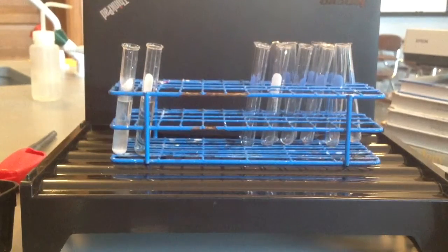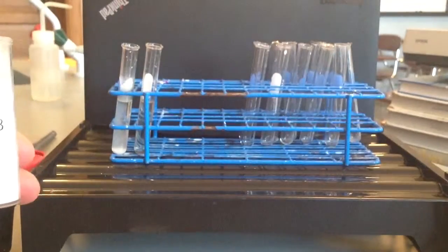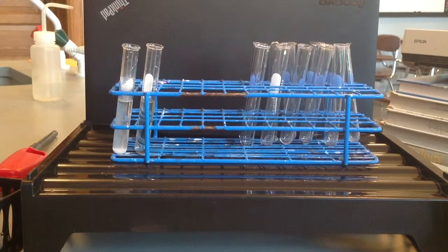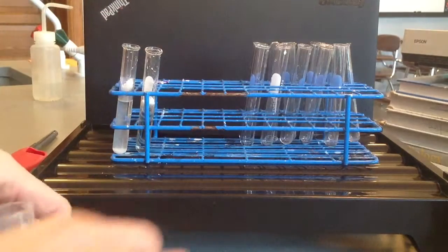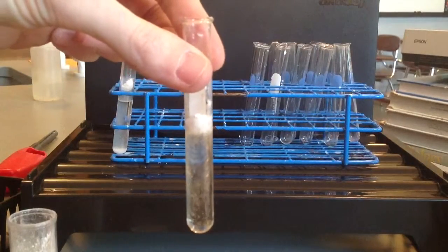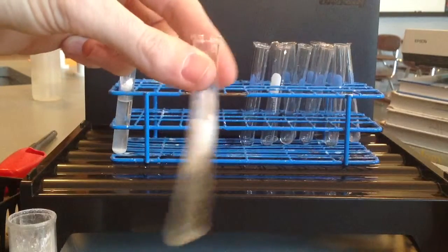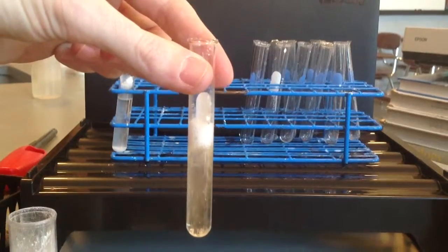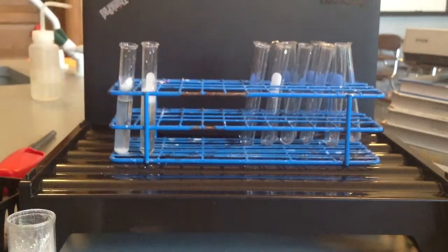I'm going to go ahead and add a very small sample of calcium carbonate. So again, our calcium carbonate going in the test tube. I'll bring that a little bit closer so you can see what's going on. Shake. Okay, I'm going to let that sit for a second and then do the burning splint test.